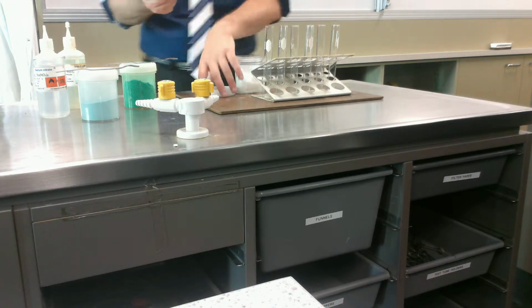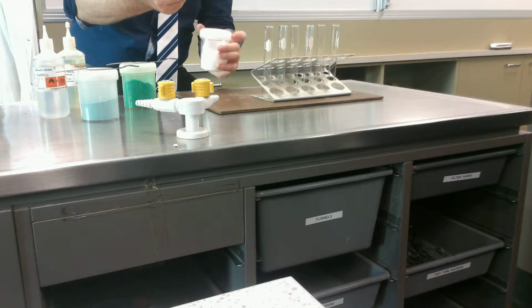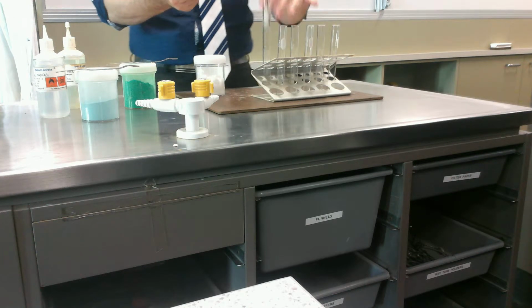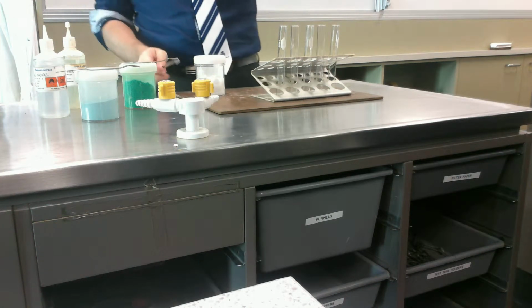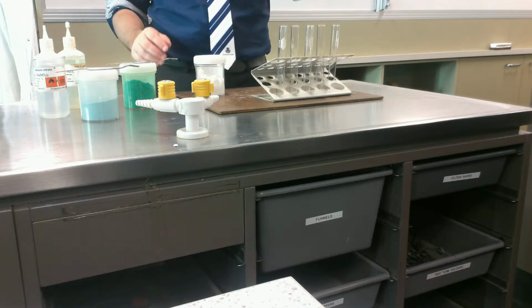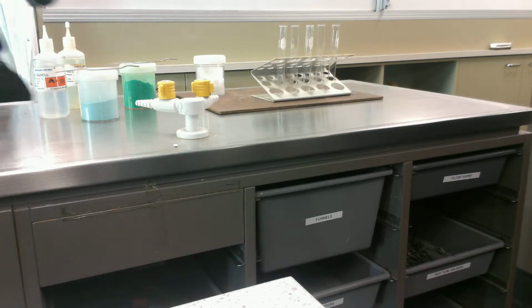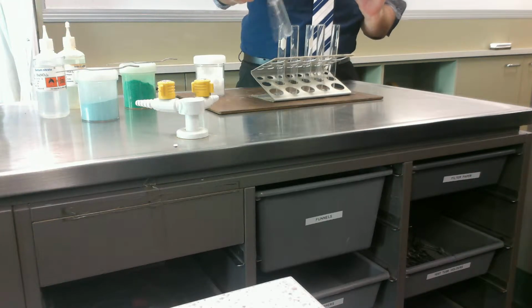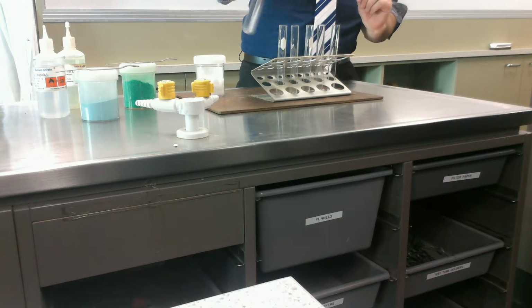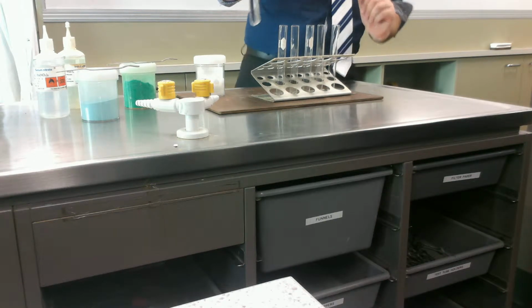So good observation. Okay, so what I'm going to do is I'm going to put this salt, which is the right word, I'm going to put the salt, this white salt, into a test tube. So this is what we call our solute, the stuff that we put in. And now I'm going to add water, our solvent, to it. And give it a pretty good shake. I might have put too much of the salt in there, but we'll see. No, it looks pretty good actually. And that solid has disappeared.